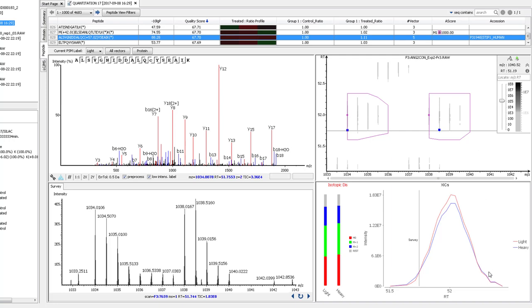This information is used to create the XIC curve showing the area used to quantify the peptide in the bottom right. A slice of the MS full scan is left. This page makes it really easy to make sure the peptides passing the filters are trustworthy.